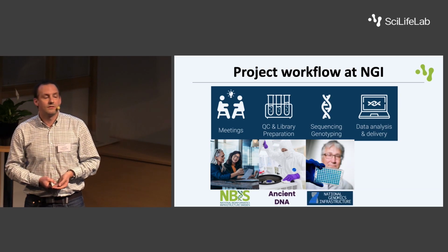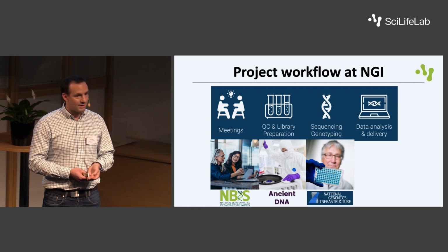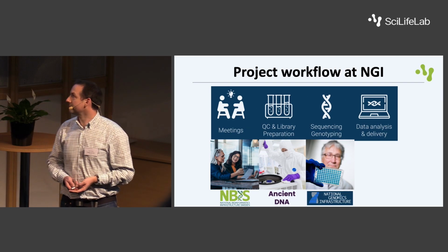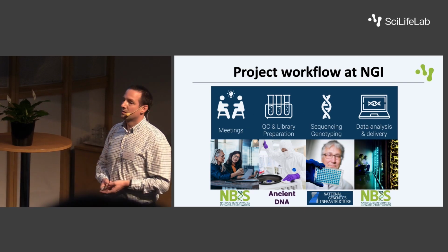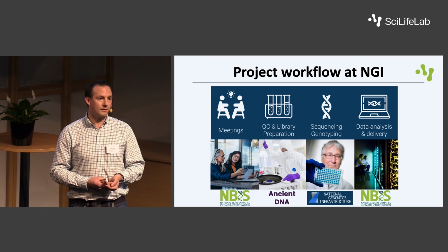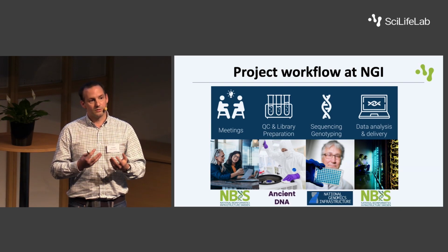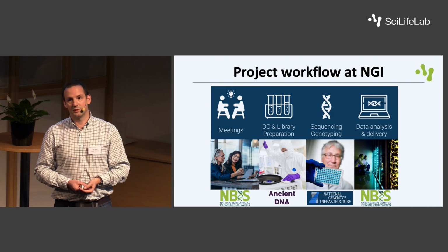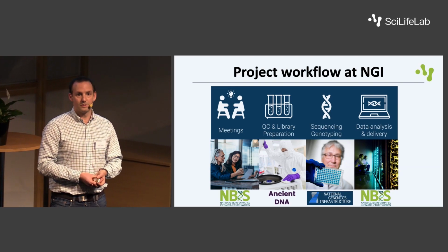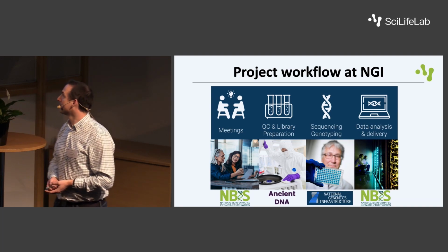The next step is the sequencing. And this is where our fantastic sequencing platforms that we have can help you. So we sequence your data there at NGI. When your sequence data is done, we will run a QC on it, and our bioinformaticians will do all the demultiplexing and everything so you get your sequences back. And this will be a good time to talk to either Ancient DNA or NBIS to help you to decide what you actually need to do with your data.